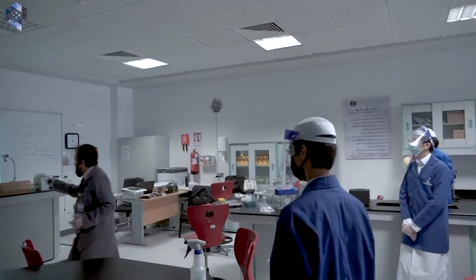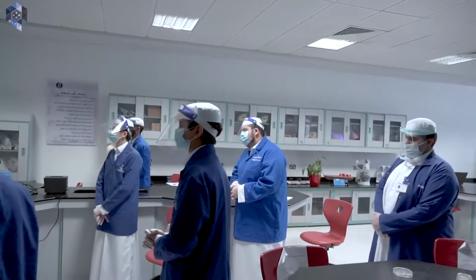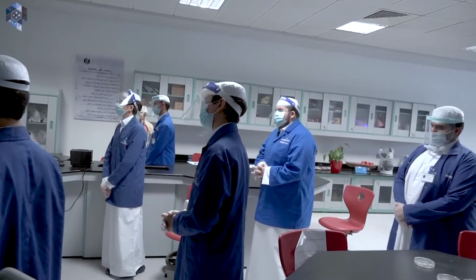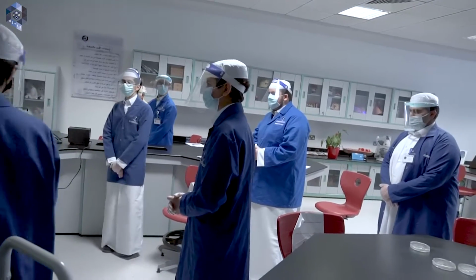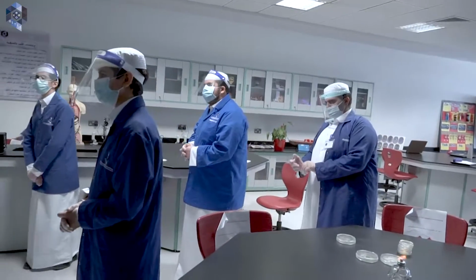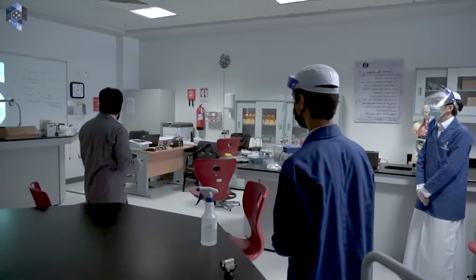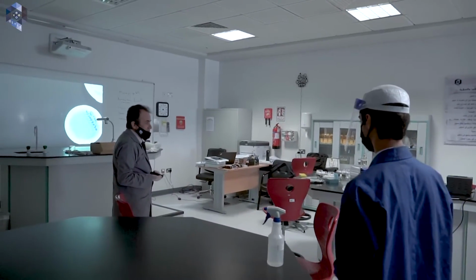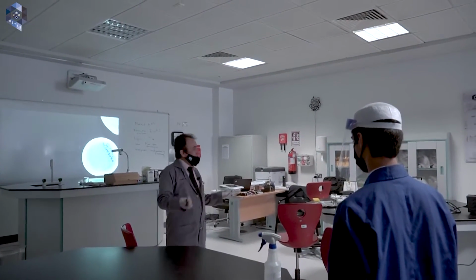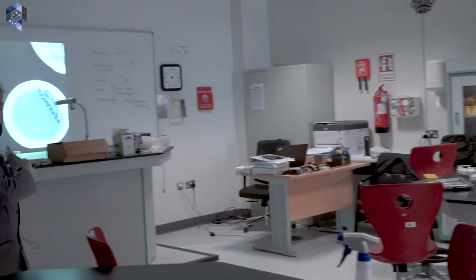Okay. The small plates, these are Kanamycin plates. Kanamycin is what? Then Muhammad Rashid, what is Kanamycin? It is an antibiotic. What does it do to the bacteria? Is it good for the bacteria? It kills the bacteria. That's why there is no growth here.